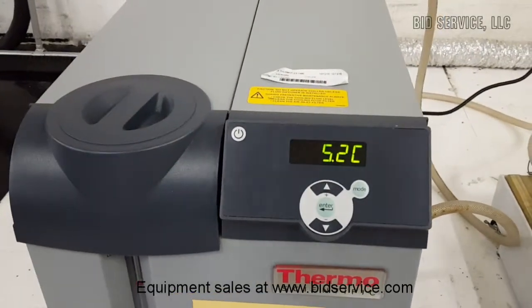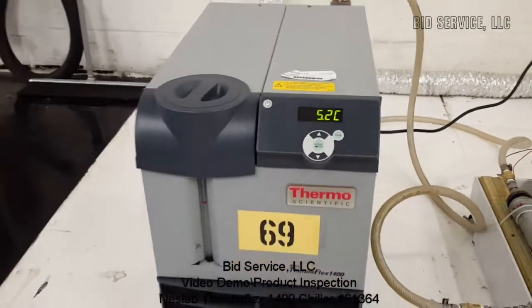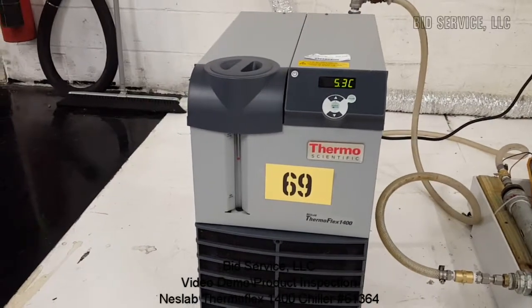And that completes this demonstration of the ThermoFlex 1400. Thank you.